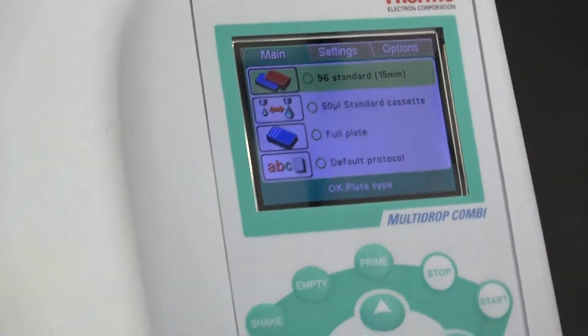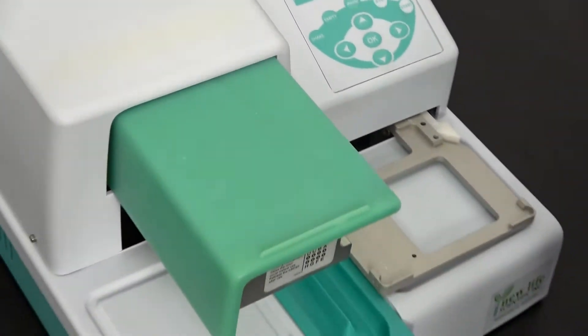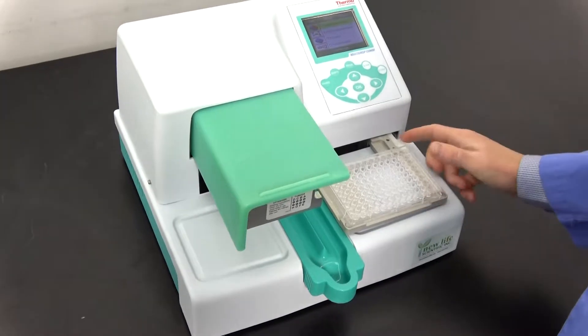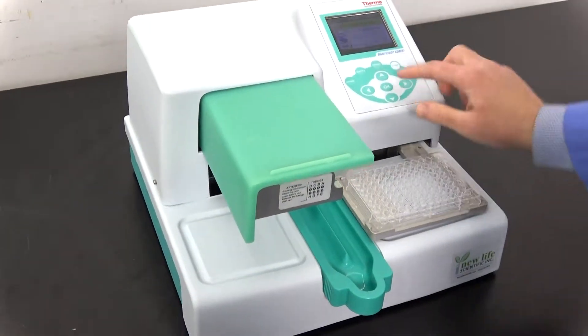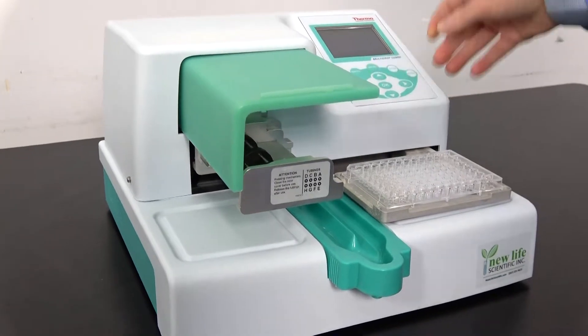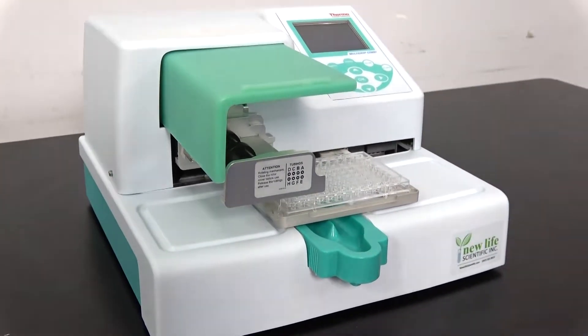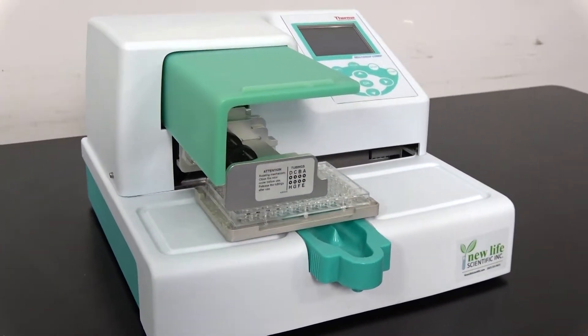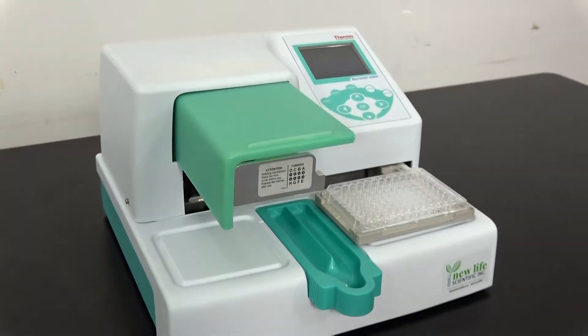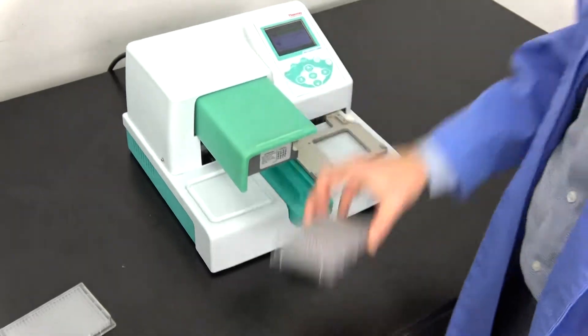Doing this is as simple as taking your 96-well plate, plopping it in the Multi-Drop Combi, and then you're going to prime. You press the prime button and let it run for just a second, press start, and boom, it is going. Maybe Bobby's fast, but Bobby's not that fast. There's 96 wells done.